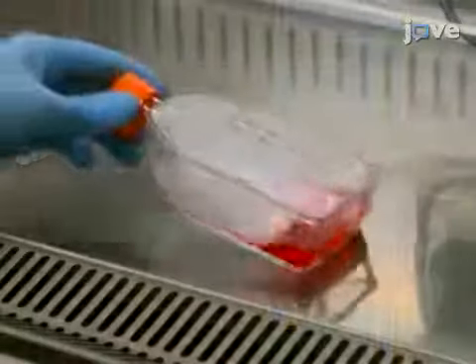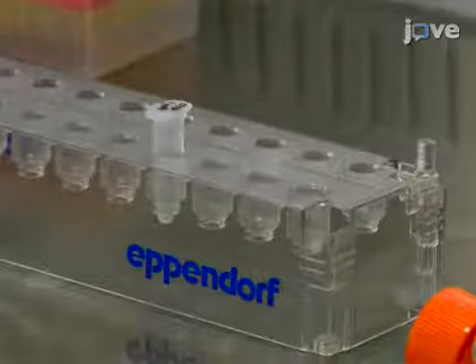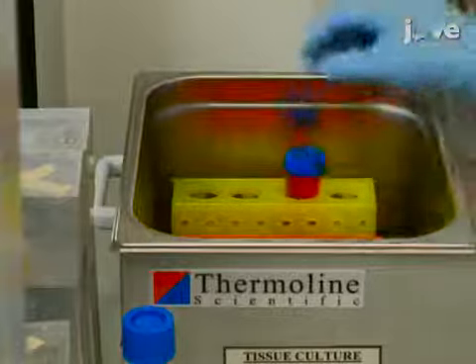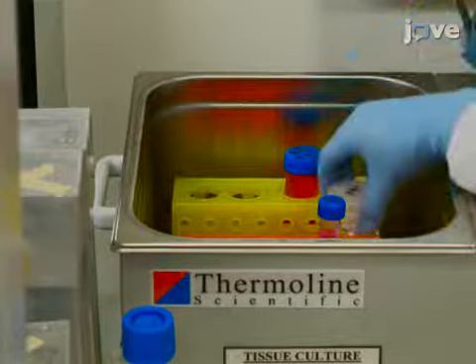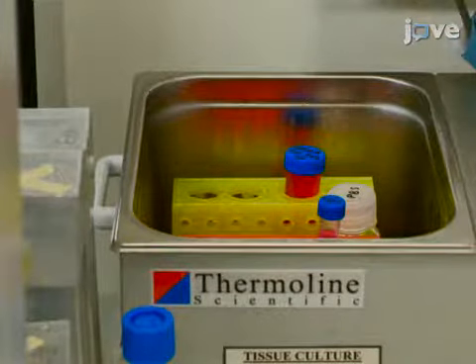To reverse transfect HeLa cells with siRNA, and after preparing the siRNA according to the text protocol, place DMEM plus 10% FCS, 0.05% trypsin EDTA, and PBS in a 37 degrees Celsius water bath for 30 minutes to warm prior to use. For each experiment.